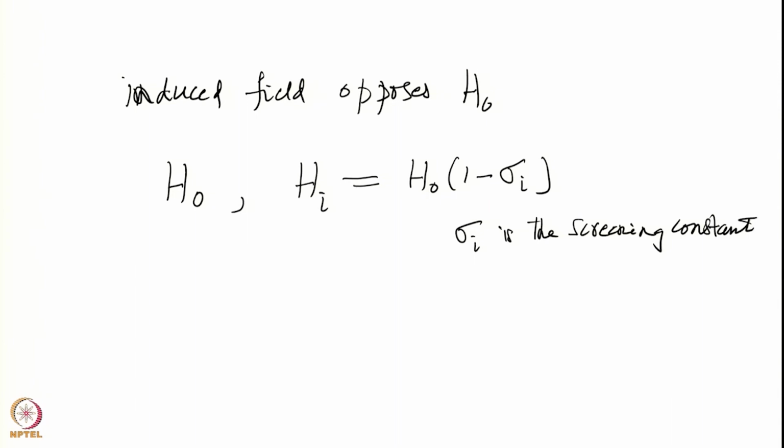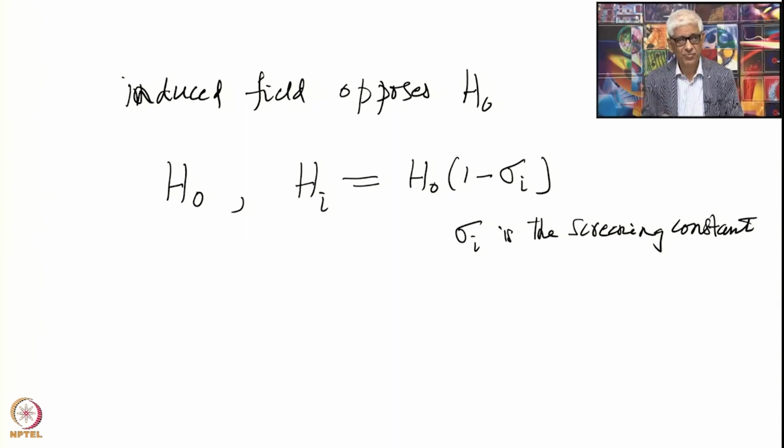So therefore there is a shift. If there is an electron density variation, an electron environment variation around the nucleus, depending upon the structure of the molecule, then you will have different fields for different nuclei. Although it is all proton, the different protons will experience a different field and therefore absorb energy at different fields.